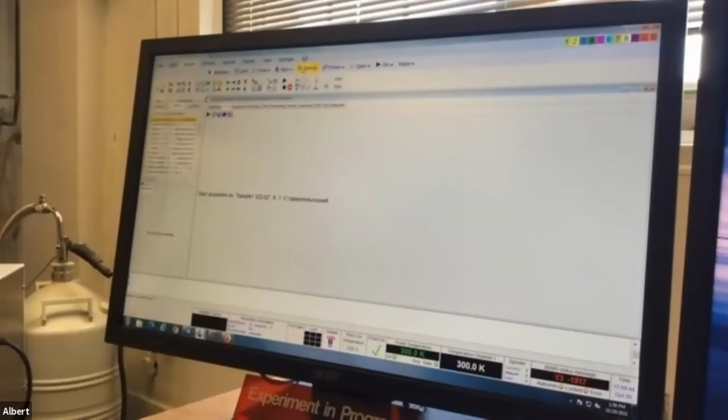So you want to make sure that the magnetic field inside that canister is the same no matter where that sample is when it's spinning. So the shimming takes longer. It used to be done by hand. This was a physical pattern on the table. And that knob, you would shim the Z1, Z2, and Z3 axis until this display looked like that.